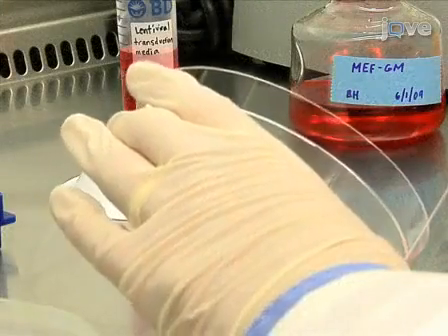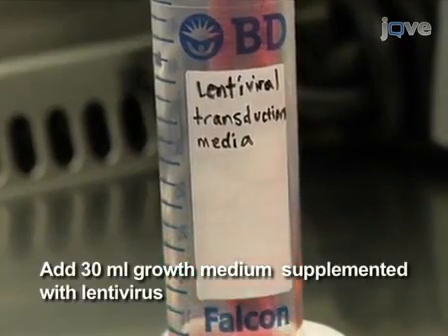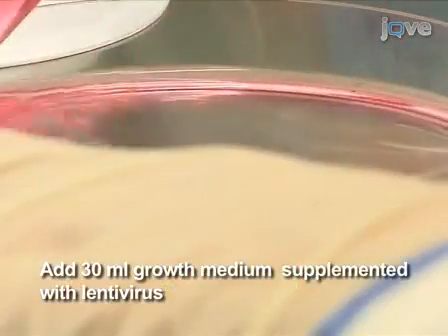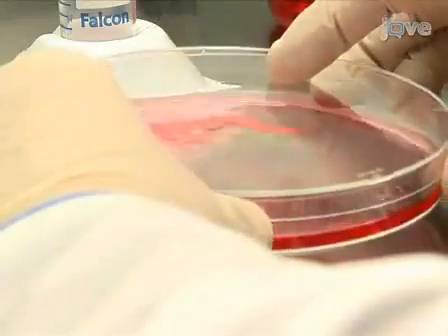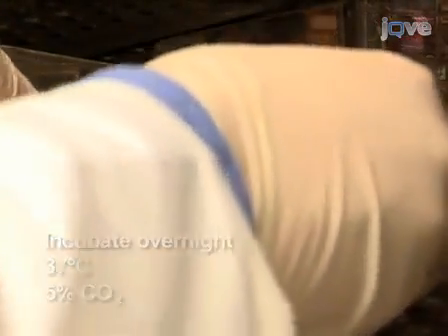When finished incubating, aspirate the medium and add 30 milliliters of growth medium supplemented with concentrated lentivirus. Rock the dish gently to ensure even distribution of the medium. Incubate the cells overnight at 37 degrees Celsius and 5% carbon dioxide.